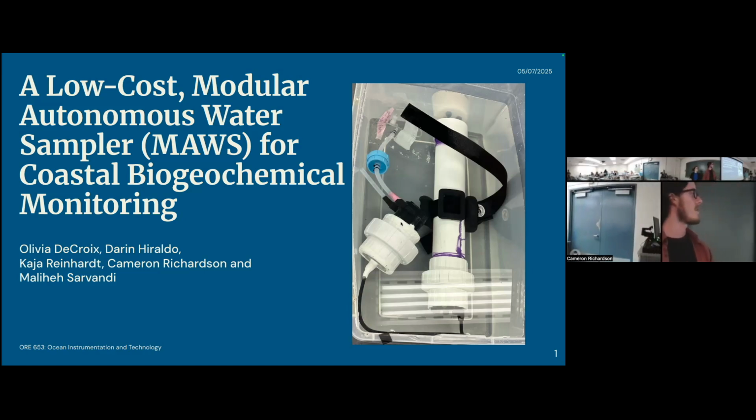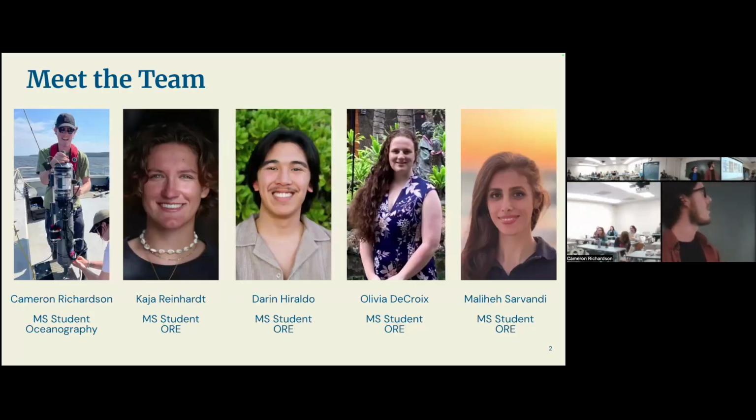We're going to be presenting our work from the spring semester, or 653, in which we developed a low-cost modular autonomous water sampler for coastal biogeochemical monitoring. So this is our team. I'll start by introducing myself.